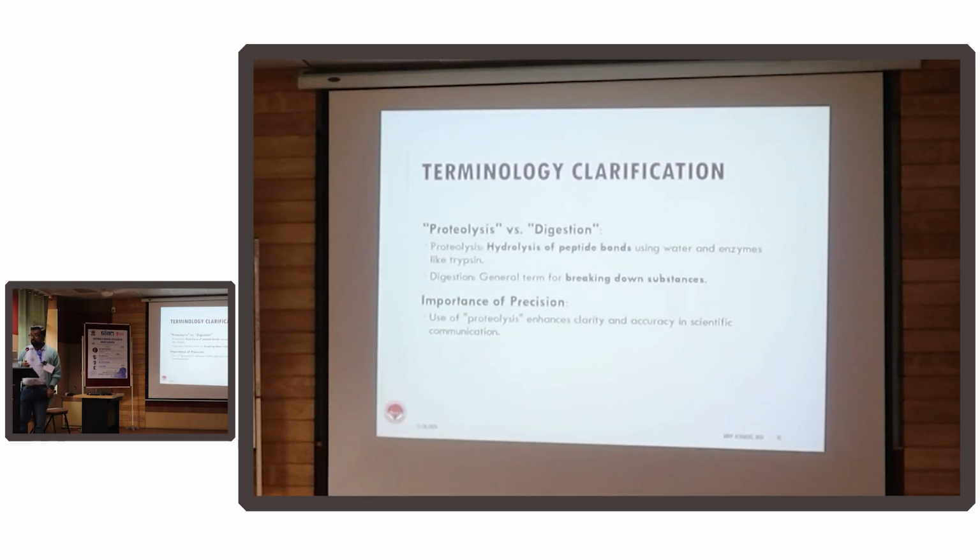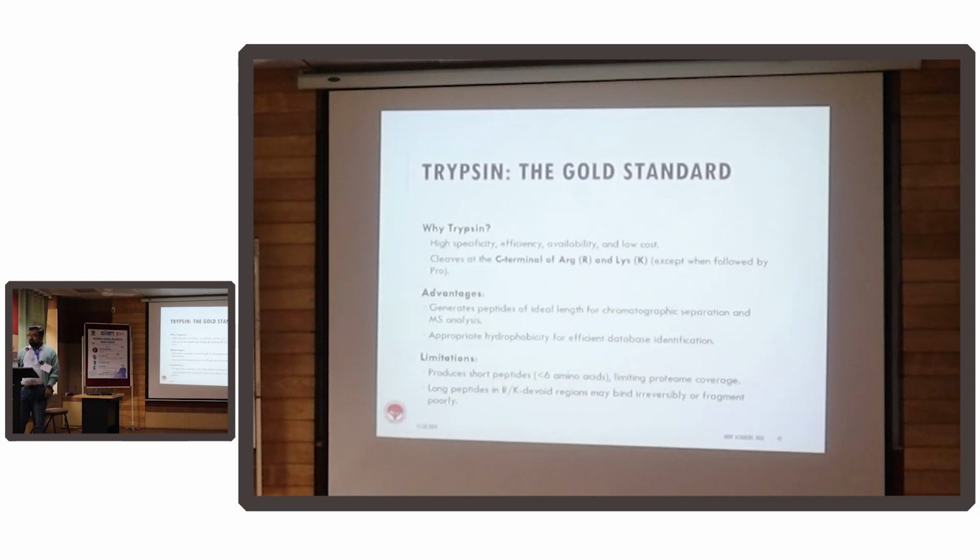Although we use the term proteolysis for trypsin digestion, digestion is a very general term. In scientific literature, avoid using the term digestion. You can use trypsin proteolysis, because proteolysis is hydrolysis of peptide bonds, and that is what trypsin does, right? Digestion is just breaking down. It does not involve the specificity of an enzyme-catalyzed reaction. Although in common terms, maybe in your lab, we just call it trypsin digest or tryptic digest.